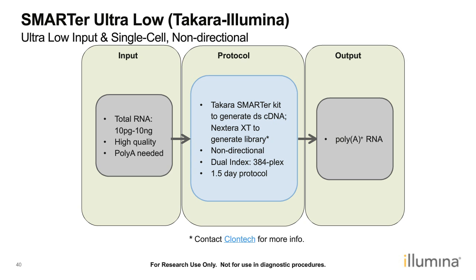And because we are using the Nextera XT workflow for library preparation, we can use the dual indexes from this kit to multiplex up to 384 samples. Keep in mind that this workflow is not stranded.